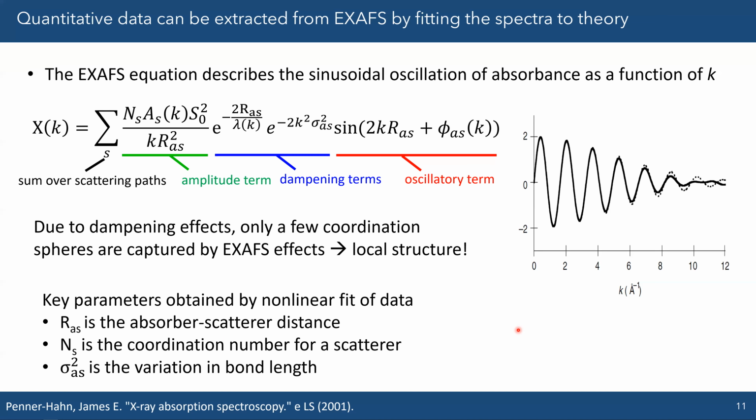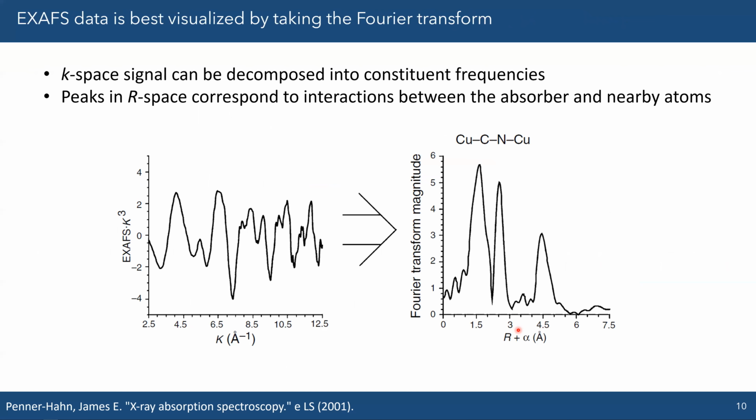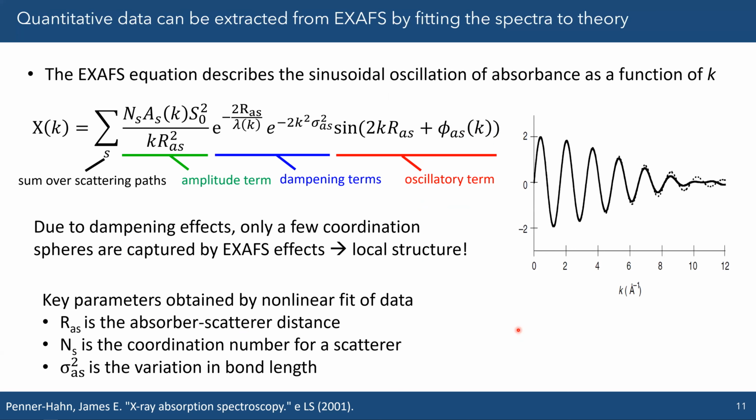Okay, interesting. The other factor too is that XAS is element specific, right? Whereas PDF won't be. That's true. I've never done PDF, but you will probably run into some problems trying to identify what each peak in the PDF is, but there are pretty good ways of simulating PDFs, right? So you can attribute them pretty well, I'm assuming. Yeah. It might be a benefit for this to be element specific. Cool, thank you.